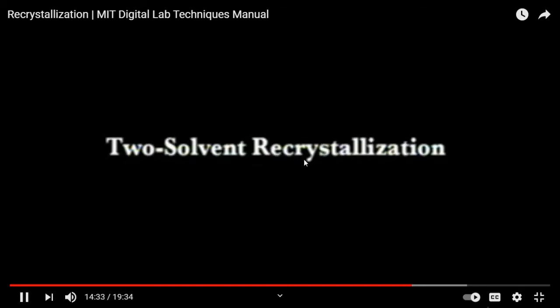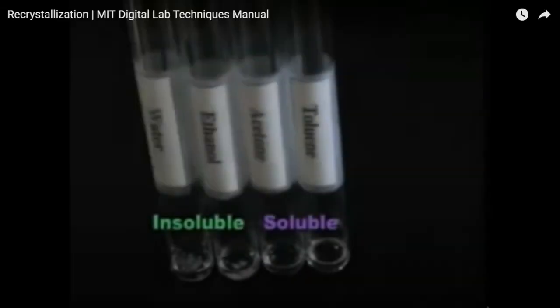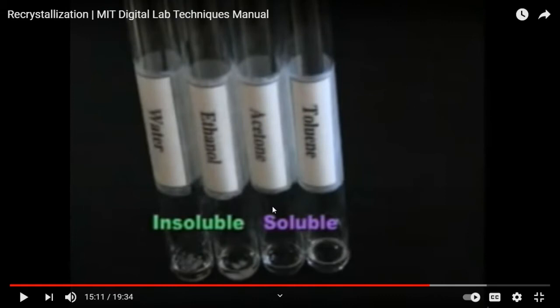When one solvent cannot be found for a crystallization, it is possible to use a mixture of two solvents. Once again, you must choose the solvents very carefully. In the first solvent, solvent 1, your sample should be soluble even at room temperature. And in the second solvent, solvent 2, your sample must remain insoluble even at the boiling point. The two solvents must also be miscible at all ratios so that they don't separate out into different layers during the recrystallization.